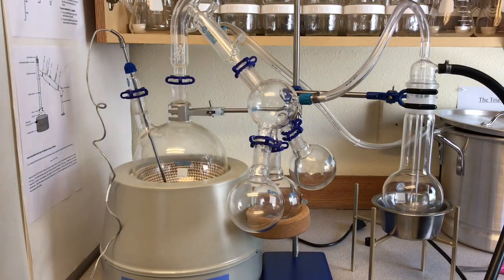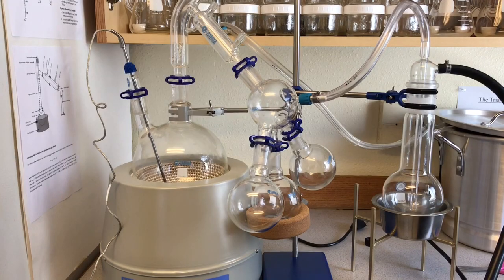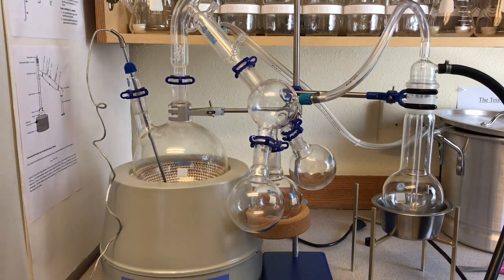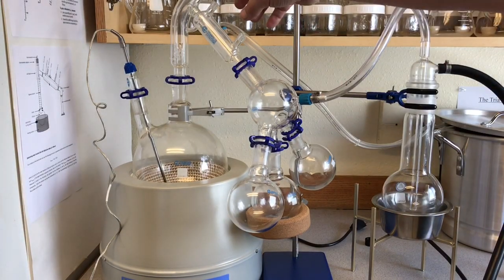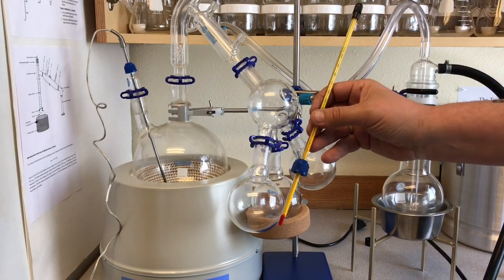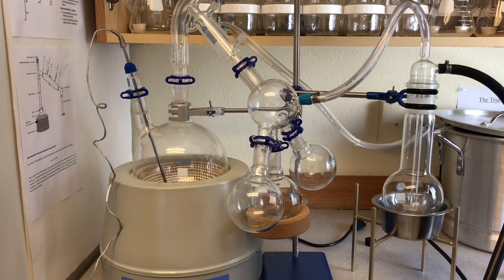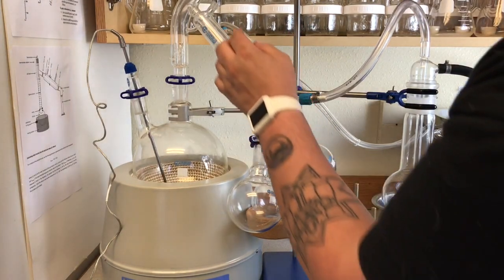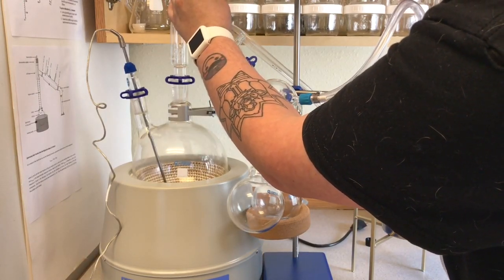So the same thing, I'm just going to wrap these threads with a little bit of Teflon tape, and the next thing we'll do is get some cold water and some ice in our bucket here, and we'll be almost ready to get started. So I wrapped some Teflon tape around this top connection here, and now we're going to add our glass thermometer, a 12-inch thermometer, and we'll just put this guy in here, and I'll show you when I get done screwing this on here real quick.